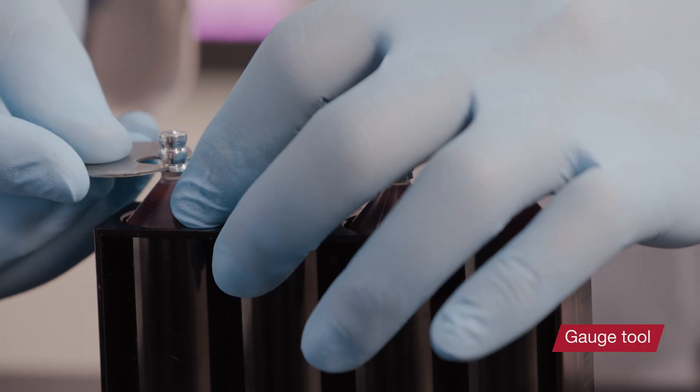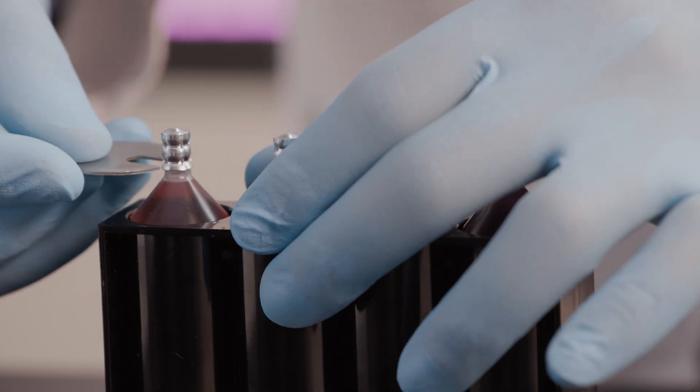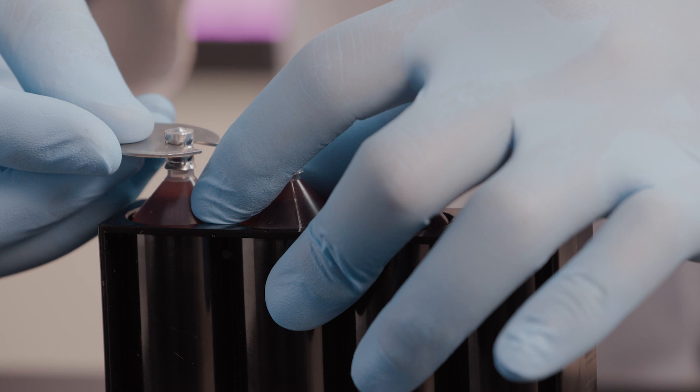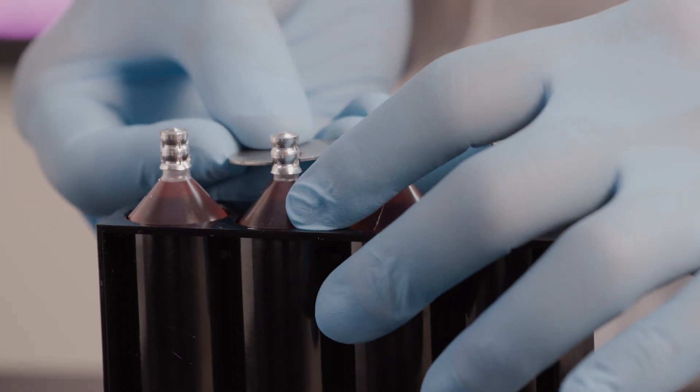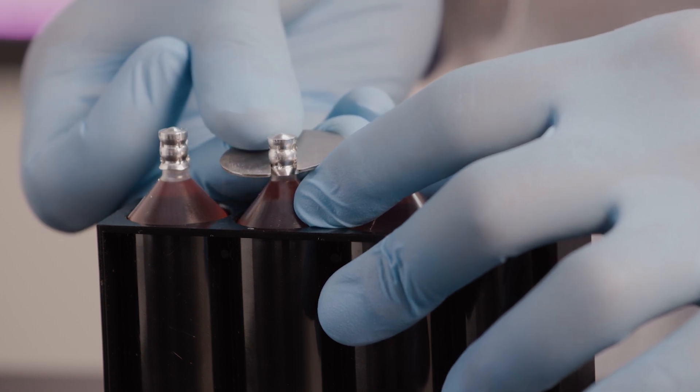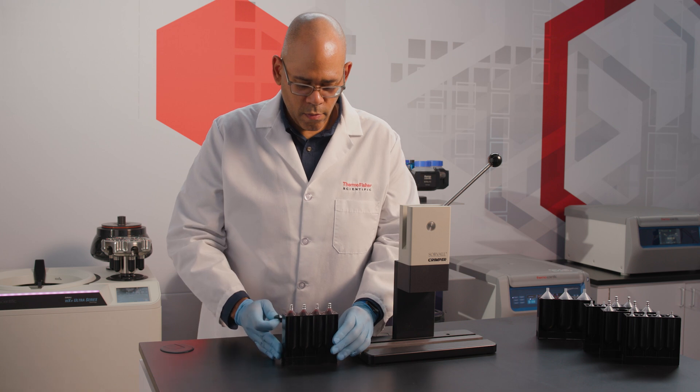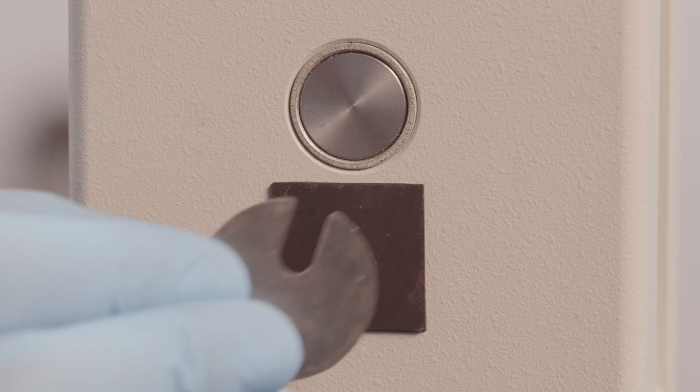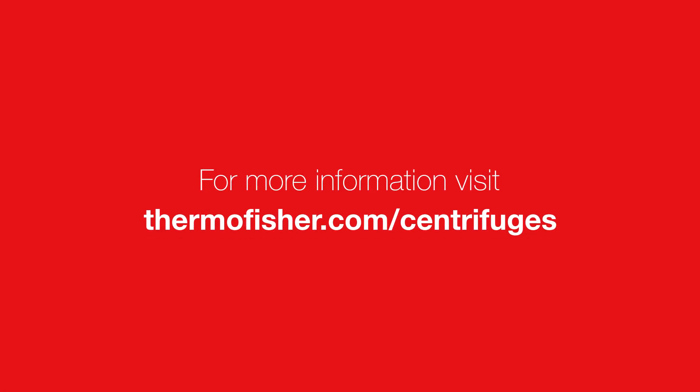Use the special gauge supplied with the crimper to periodically check the seals and verify proper crimper function. When a tube is properly sealed, the slot in the gauge should fit snugly around the narrow crimped portion of the aluminum cap. Use the magnet on the back of the cam housing to safely store the tool.